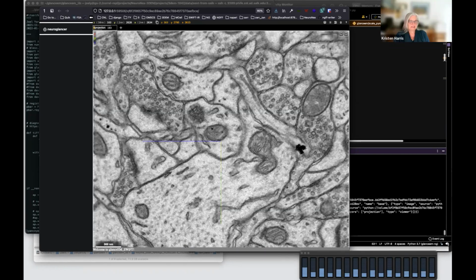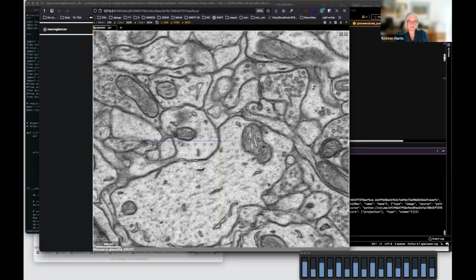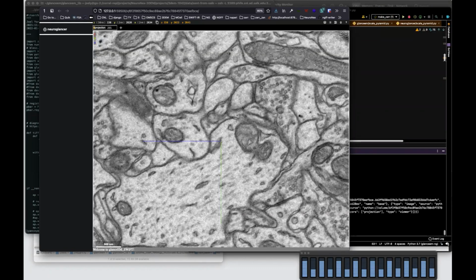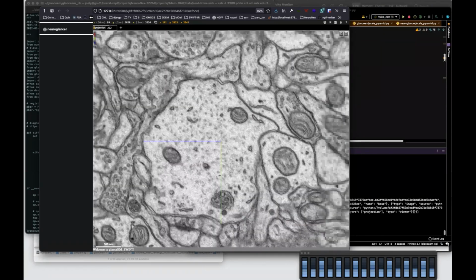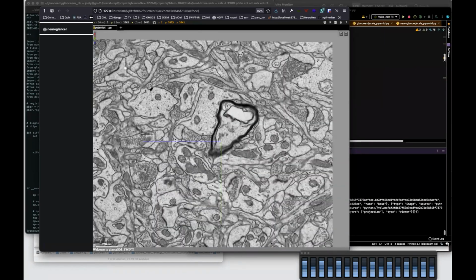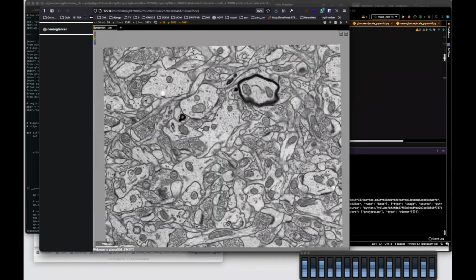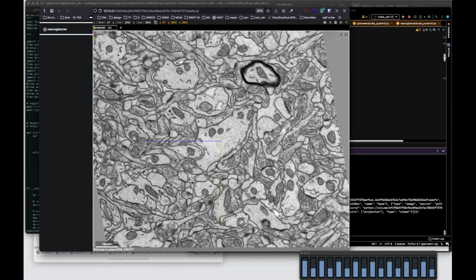Can you blend two adjacent images? That will help us see how good the alignment is. Can Neuroglancer do that? No, I don't think so. You can't blend two adjacent. No, you'd have to write that function. That's a very useful function. I mean, it wouldn't be hard to write that, right? You just have the same layer offset as a separate layer, and then you have a 0 layer in the middle, and then you just blend them and write it into it. You could do that offline.